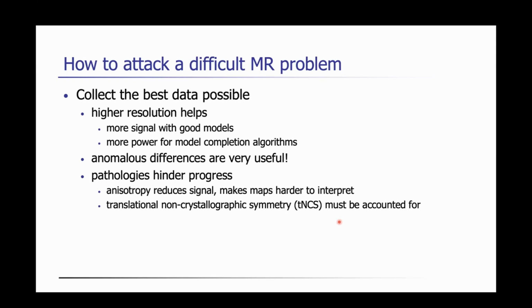Don't forget about using anomalous differences. If you collect your data set, if you have a chance of getting anomalous differences, like choosing a wavelength or collecting high redundancy data, go for it, because it's going to help you later. We'll show you that in the tutorial.